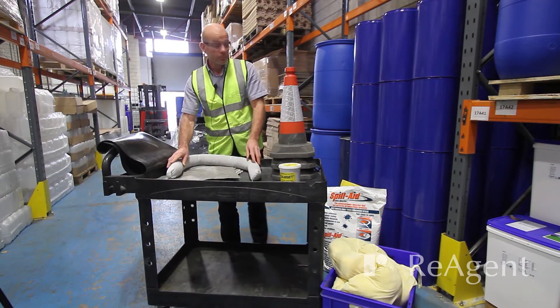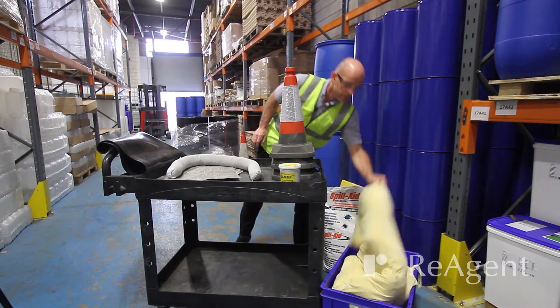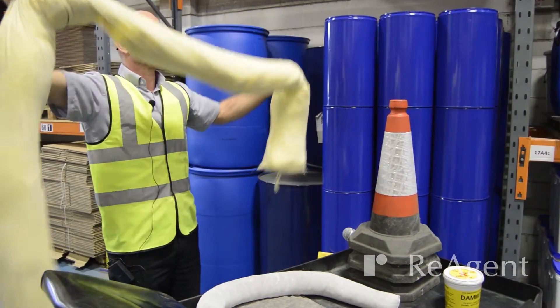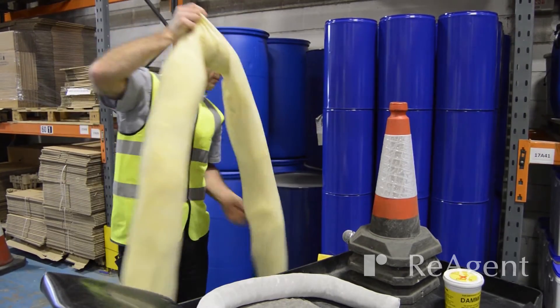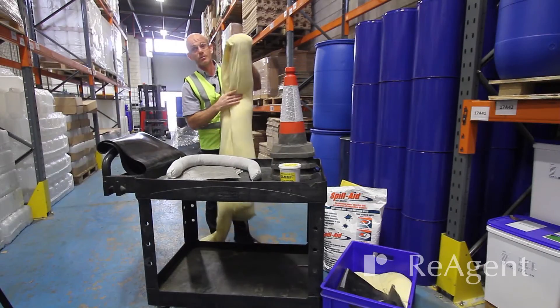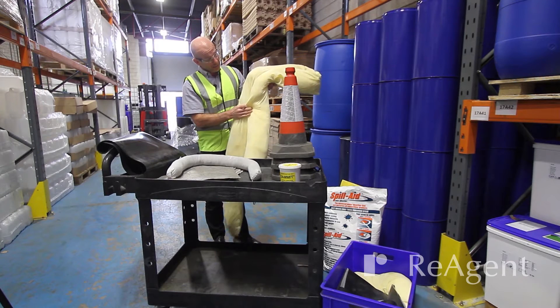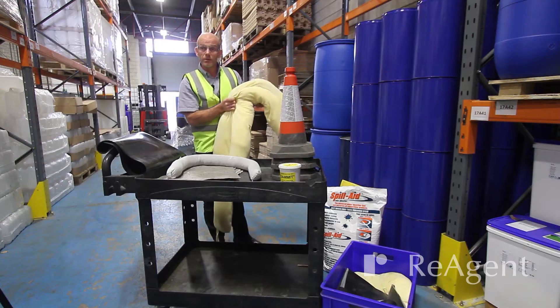We also have these very large sausage-type booms, about three meters long. We've got about six of these, which can be wrapped around a much larger spill. These are very absorbent and will take up a lot of liquid.